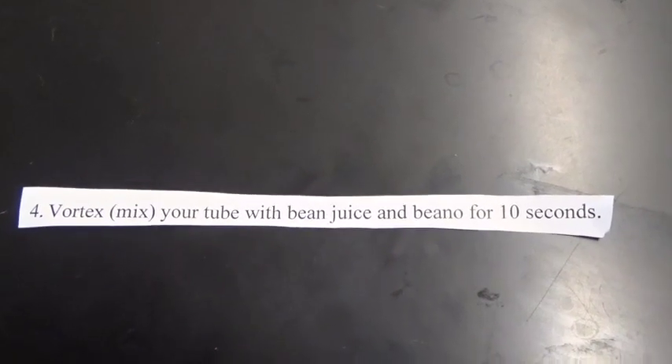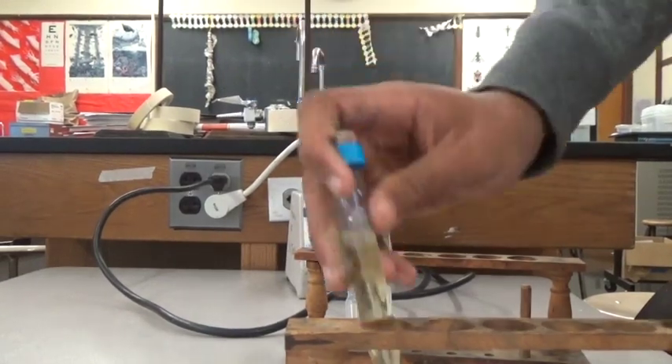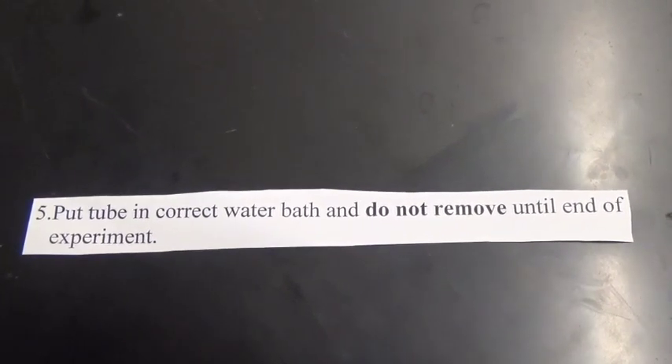Number four. Vortex your tube with bean juice and Beano for 10 seconds. Number five. Put tube in correct water bath and do not remove until end of experiment.